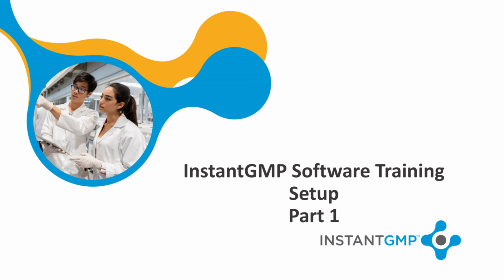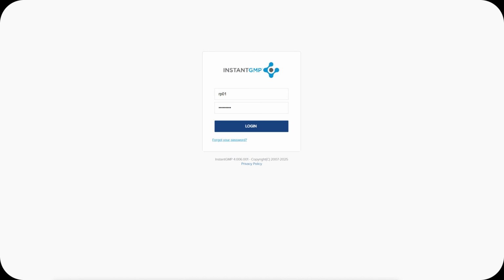Hi, and welcome to the InstantGMP software overview of the setup process. In this three-part series, we'll walk you through how to navigate the system and set up your instance. This is video 1. We'll begin with logging in.